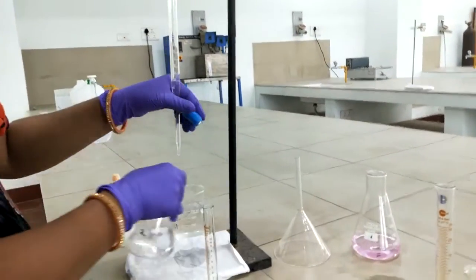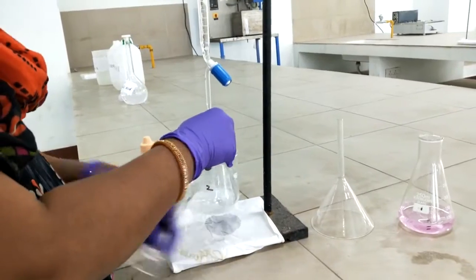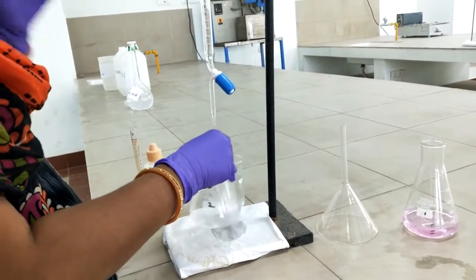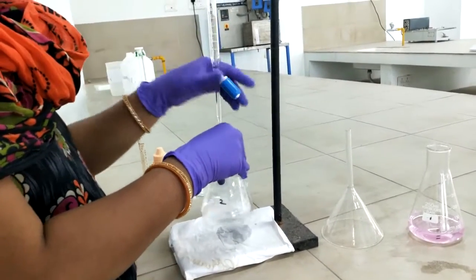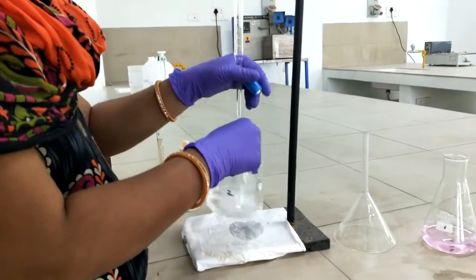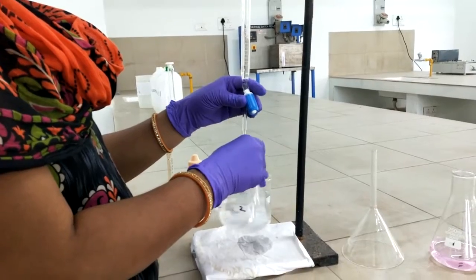So take the second conical flask and titrate it against NaOH. What is this? 10 ml of sample corresponding to 70 rpm, and we have added 20 ml of HCl and 2 drops of phenolphthalein indicator, and we are titrating it against NaOH solution. That is 0.05 normal NaOH solution.